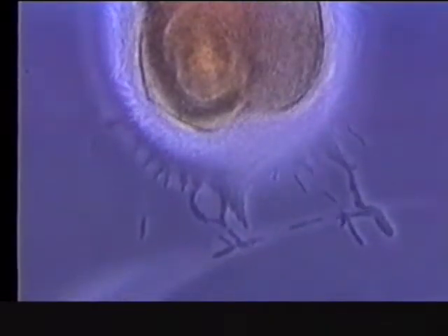We call populations of myxobacteria swarms. So a small swarm is coming out, in fact, in more than one place from this sporangiole. See in the top and in the bottom. And this is the latest stage.